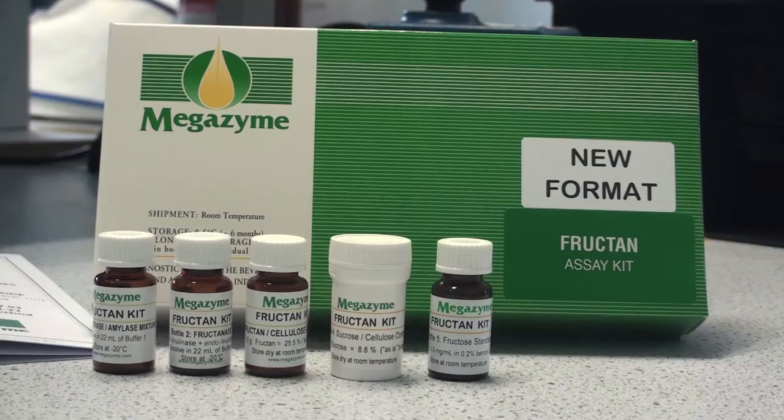The fructan kit as received should contain an instructions booklet, a bottle of sucrase plus beta-amylase pullulanase and maltase, a bottle of fructanase, fructan control flour, sucrose control flour, and a D-fructose standard solution.